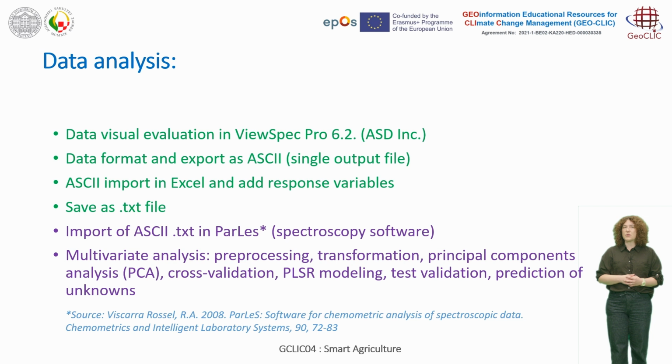Data analysis, which we use here, this green part is the data analysis I have already done. And this, in the purple color, is what we will do with your task, and I will demonstrate it for total carbon content. I already did data visual evaluation in spectroscopy software. Within this software, I use data formatting and I export it as ASCII as a single output file. Then the same ASCII single output file I import in Excel and I add response variables.